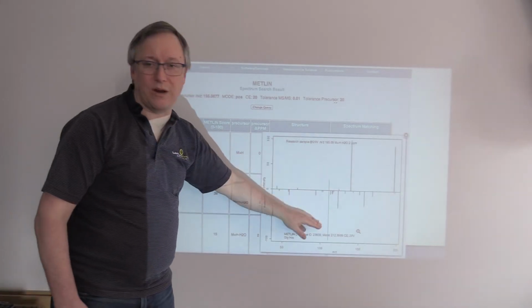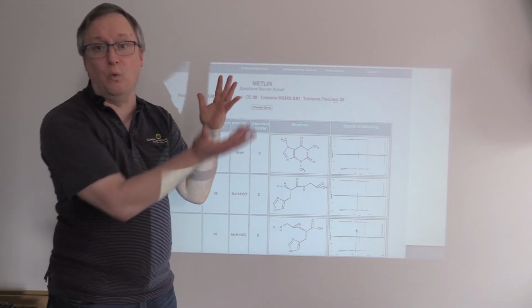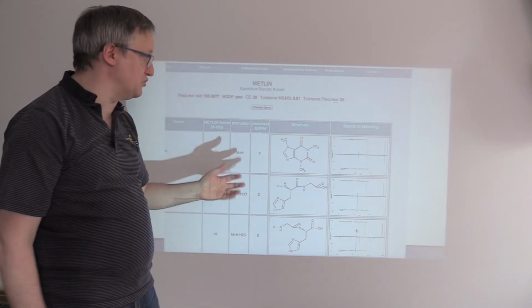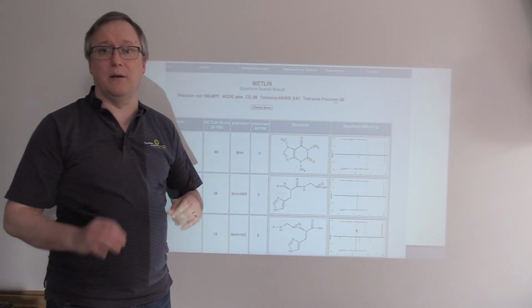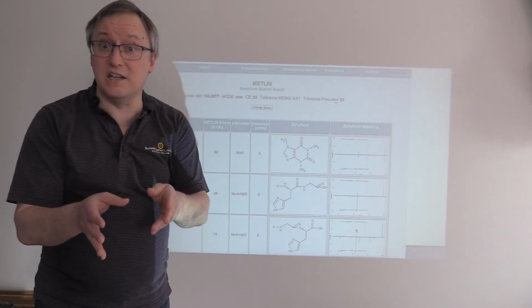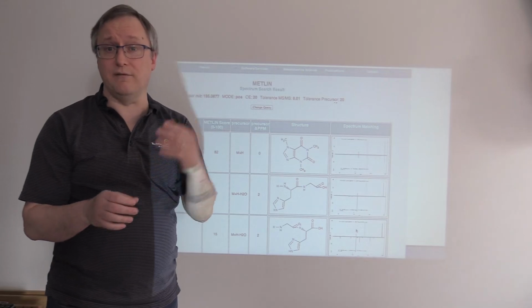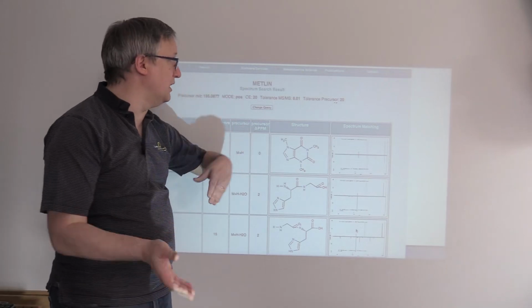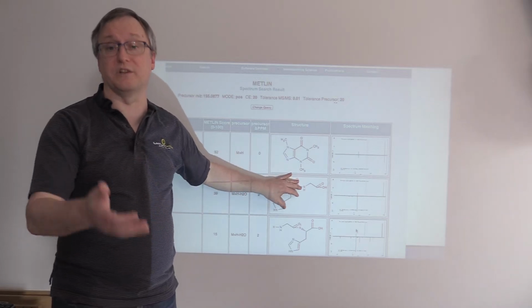So it's a very quick way to visually assess, does what I observed match what the spectrum library says should be there. Okay, so that's a pretty quick example, but it's free to set up your own account on METLIN, and if you're dealing with spectra of LCMS/MS or GCMS data, this is a very valuable workhorse for you.